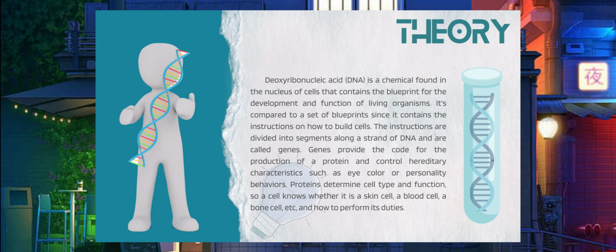So basically, DNA is present in every living thing. However, it can't usually be seen by the human eye in its natural state. So by conducting this experiment, we hope to isolate the DNA in order for it to be seen by us. For further study, try experimenting with different types of liquid soap. Try switching with plain water to see how the salt affects the experiment, and see if using lower concentration or room temperature alcohol changes your results.